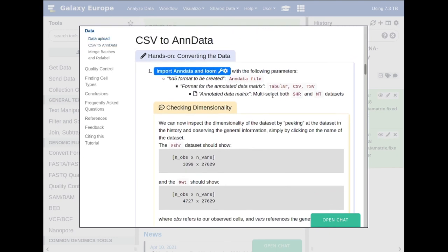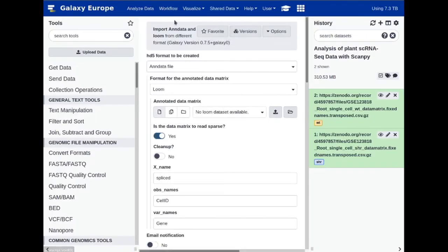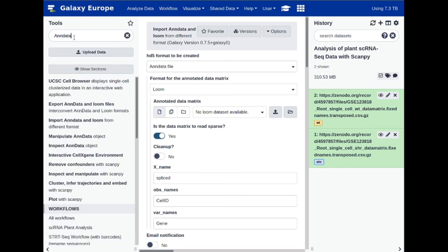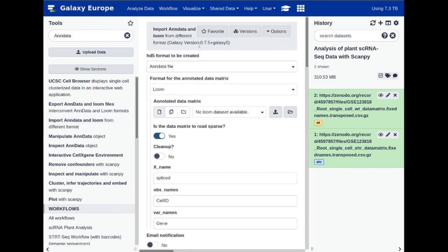If you're not yet familiar with the clickable tools, you can click on the data itself and fill in the parameters — this simplifies searching for the appropriate tool in the side panel. For example, clicking on this loads the correct tool and the correct Galaxy version, which is very neat. Otherwise, if that doesn't work because you're using a different domain, you can type 'AnnData' into the tools section, scroll down, and find the appropriate tool by clicking on it to get the exact same tool.